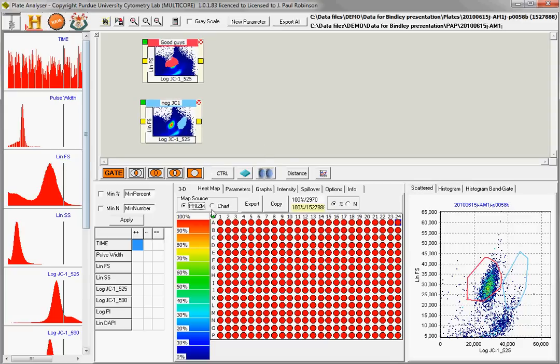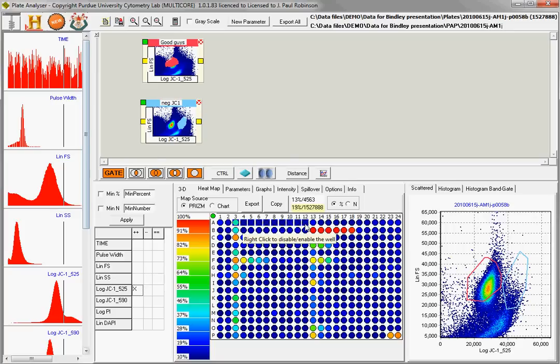So now I'm going to show you how to do a very quick IC50 curve. If we click over here, I'm doing this to point out the high concentrations of drugs with their dose responses going from column 3 to column 12 and column 13 to column 22. So to make a dose response of a drug, what we do is highlight the dose, and there are 10 points here, so I've just highlighted all 10, and then hit this blue button.